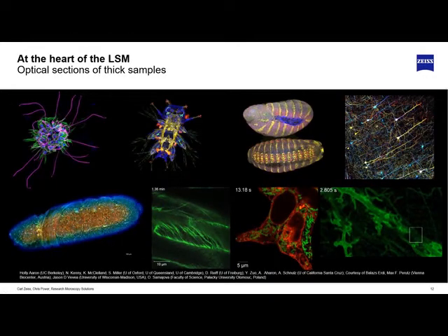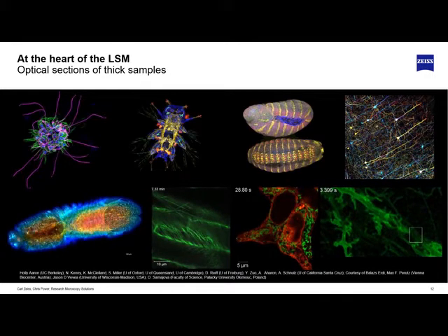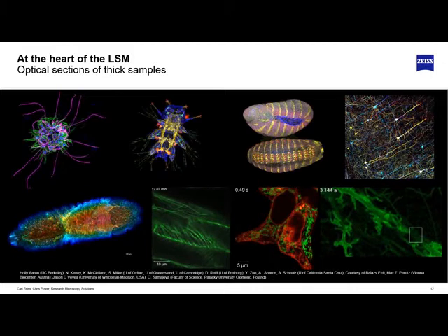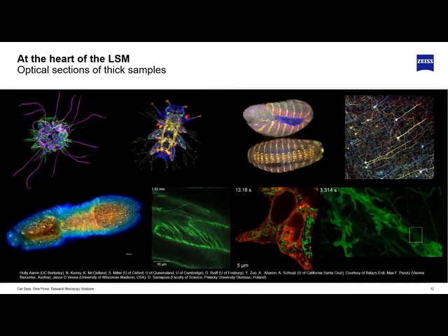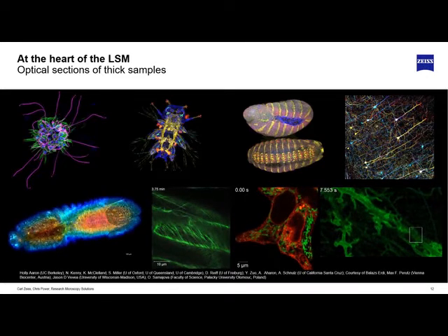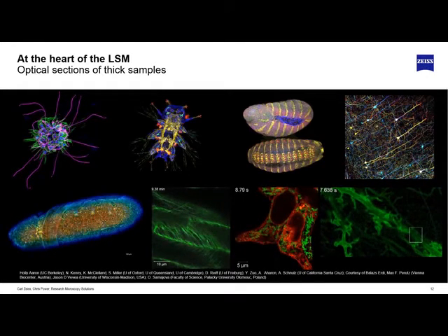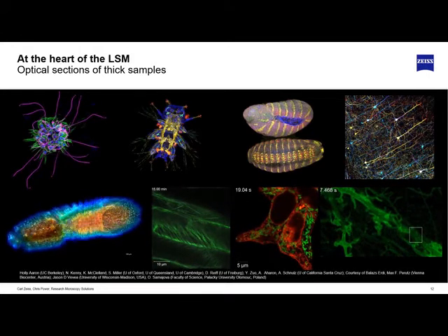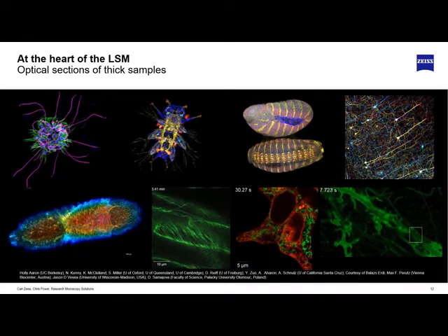Since Minsky's idea was commercialized in 1984, confocals really have moved on to become the dominant systems used in labs today. That's because they're just very, very versatile in terms of optical sectioning. Here, hopefully, if my bandwidth is holding up, you'll be able to see some examples from a whole host of applications.